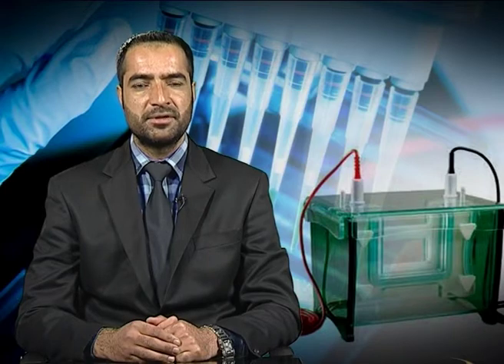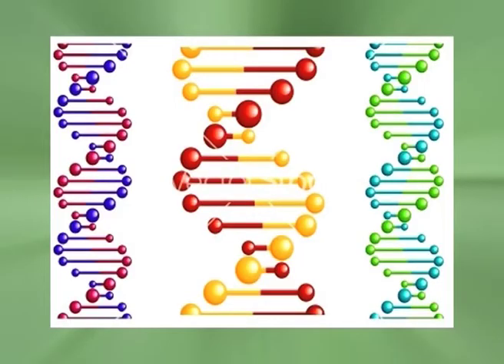Capillary electrophoresis offers the advantages of extremely high resolution, speed and high sensitivity for the analysis of extremely small samples, but is obviously not useful as a preparative method. It is especially useful in the separation of DNA molecules that differ in size by as little as only a single nucleotide.